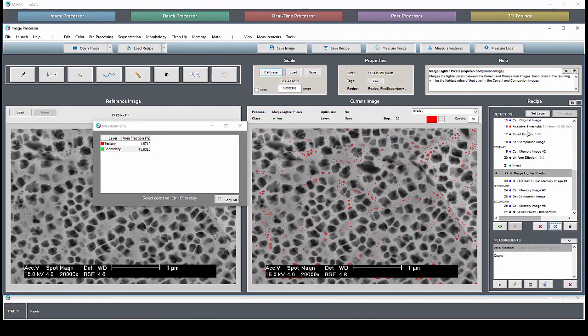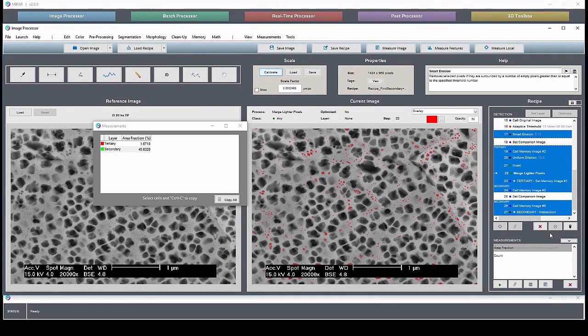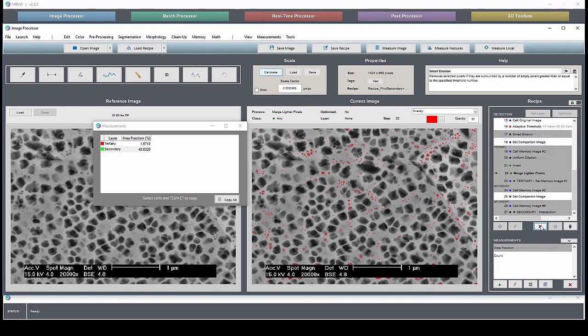You can also drag, shift, and control-click to delete several steps at once.